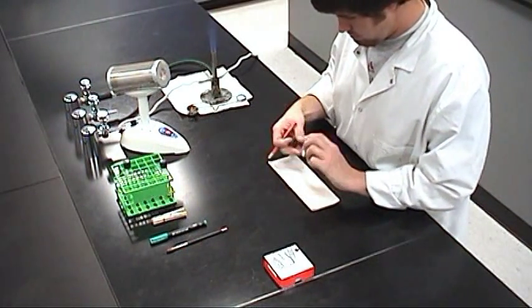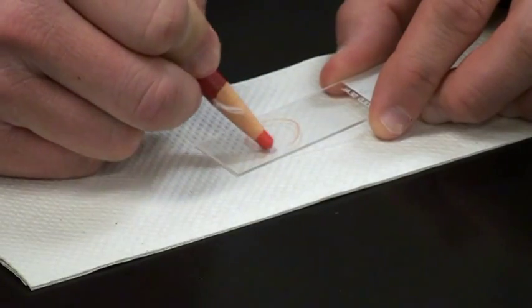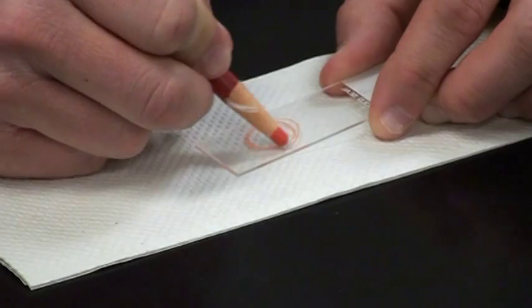Using the china marker, make a target circle about the size of a dime on the underside of the slide, about two-thirds down away from the frosted end.